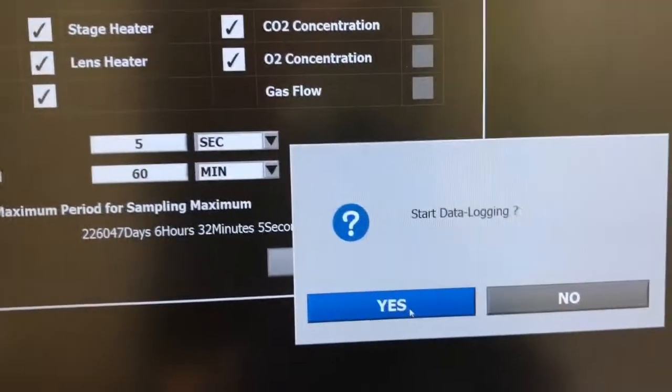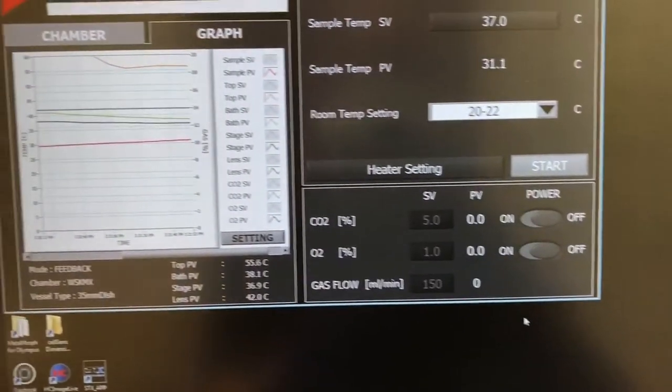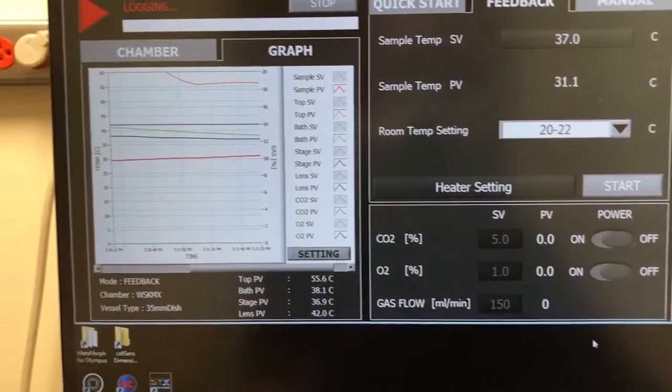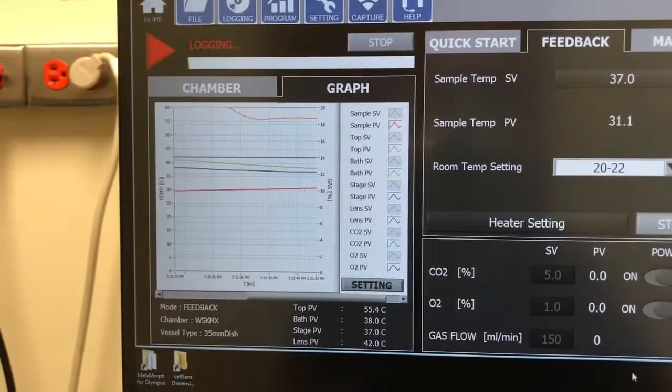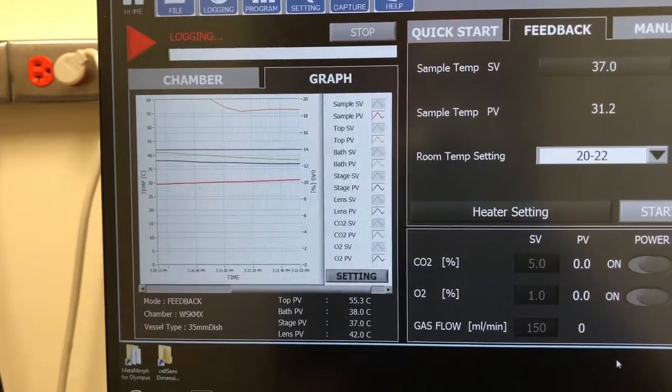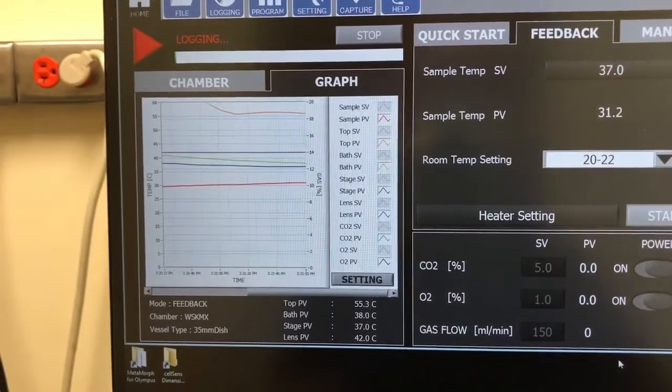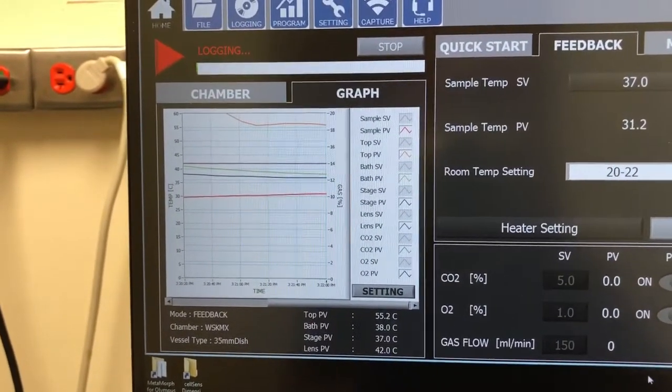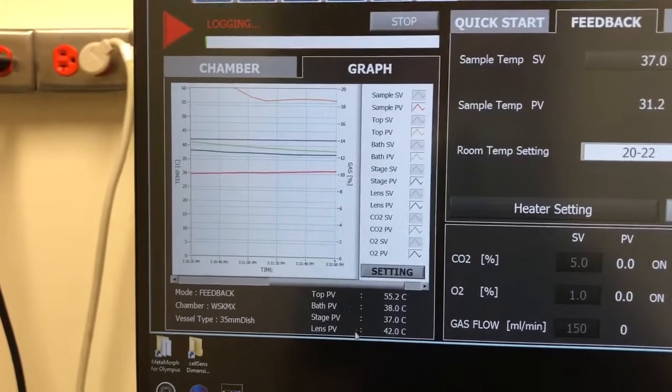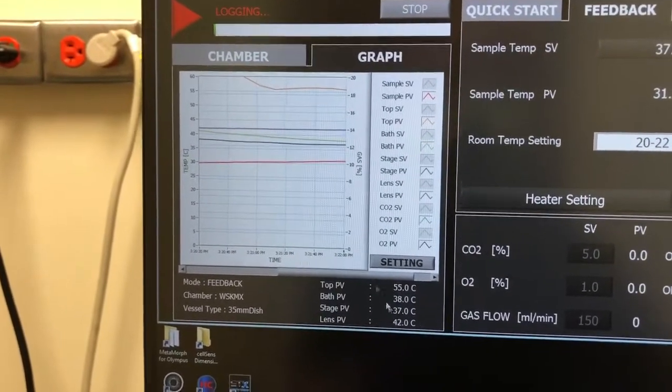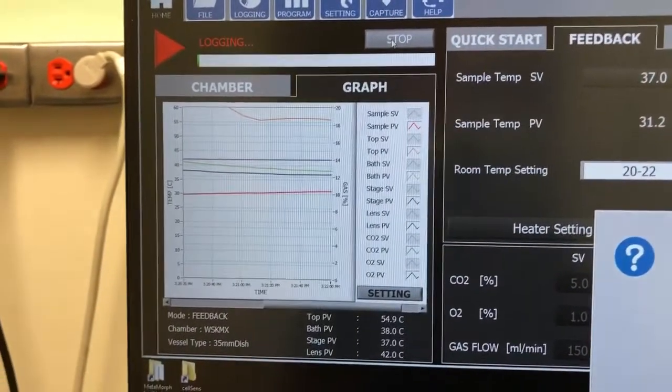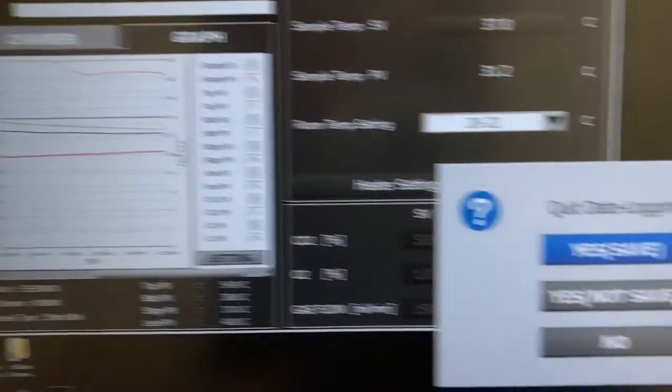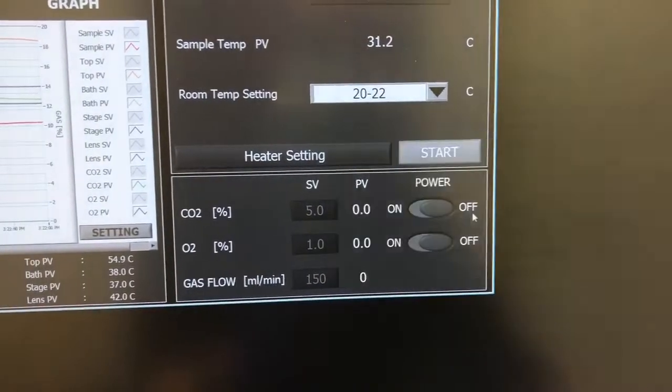And then you can say start. Say start data logging. Yes. So it'll start logging. When you are done logging. So here we just went for a few data points. You can stop it.